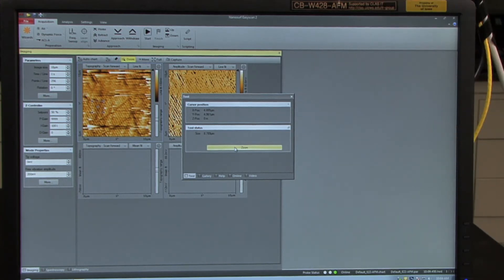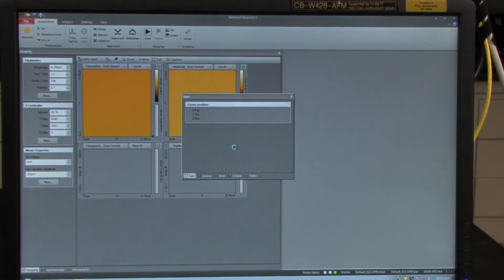And then click the zoom button, and once you've clicked the zoom button, click start, and the imaging process will start again.